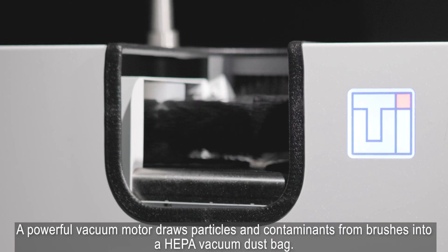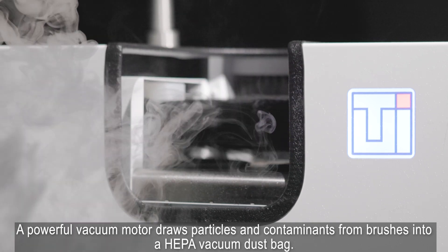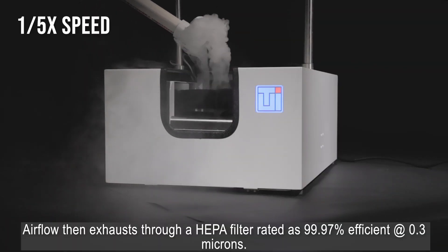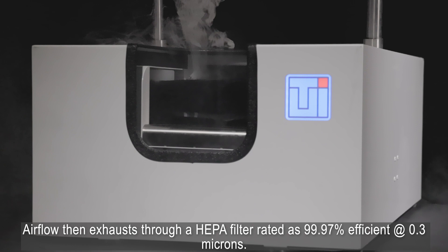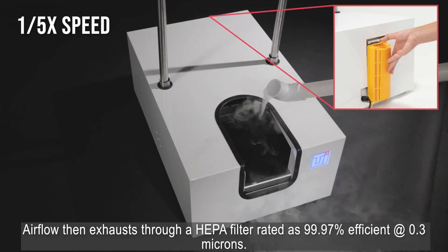A powerful vacuum motor draws particles and contaminants from brushes into a HEPA vacuum dust bag. Airflow then exhausts through a HEPA filter rated at 99.97% efficient at 0.3 microns.